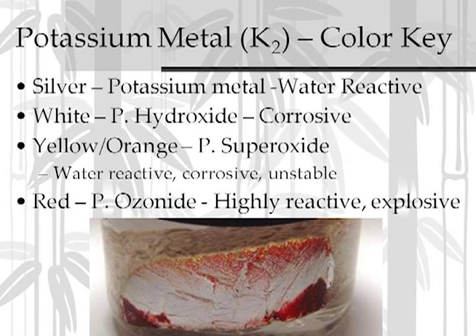So potassium metal is different than the solvents in that it's not a flammable liquid, and the peroxidation process is the same in that it reacts with the air, but it also reacts with the moisture in the air and starts that process a little more quickly. You can actually tell what stage of peroxidation it is in by looking at the color of the stick that you have under oil in the jar. If it's silver, it's brand new. You don't need to worry about it aside from the fact that it could burst into flames if it got wet, but that's probably why you bought it in the first place.